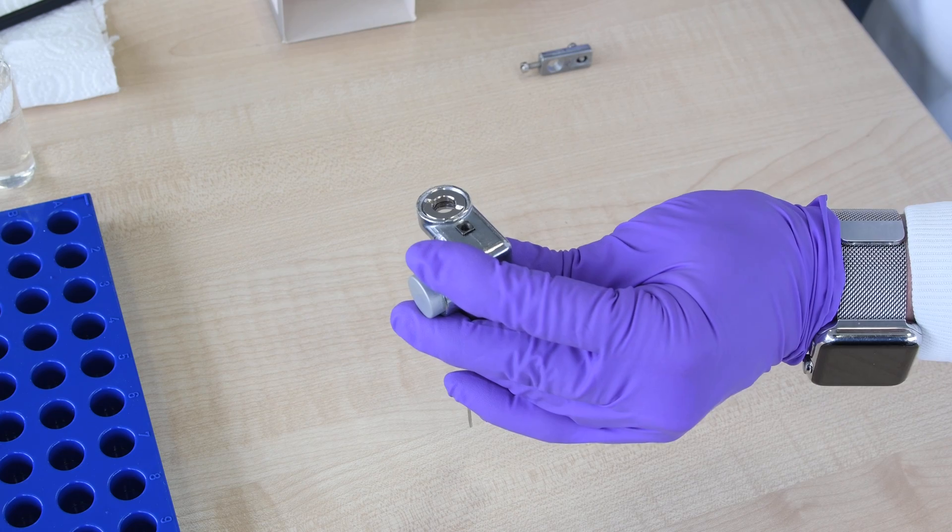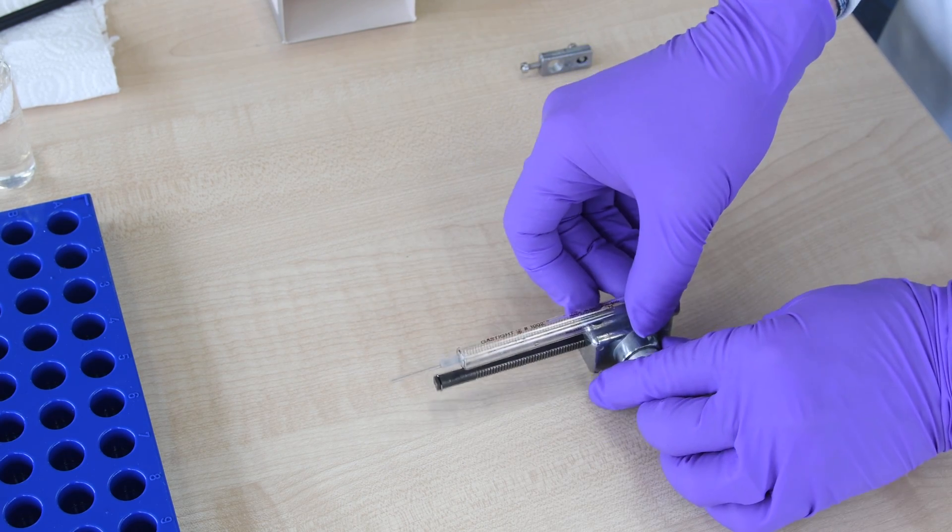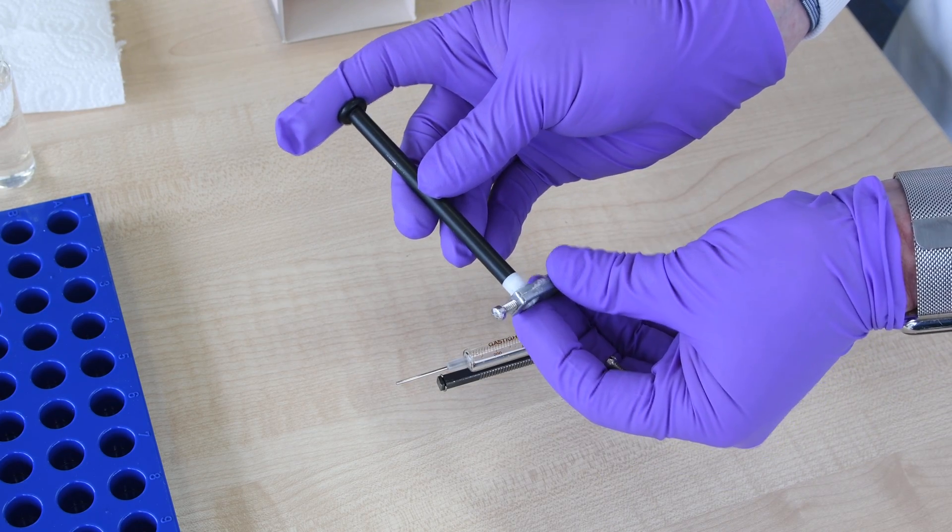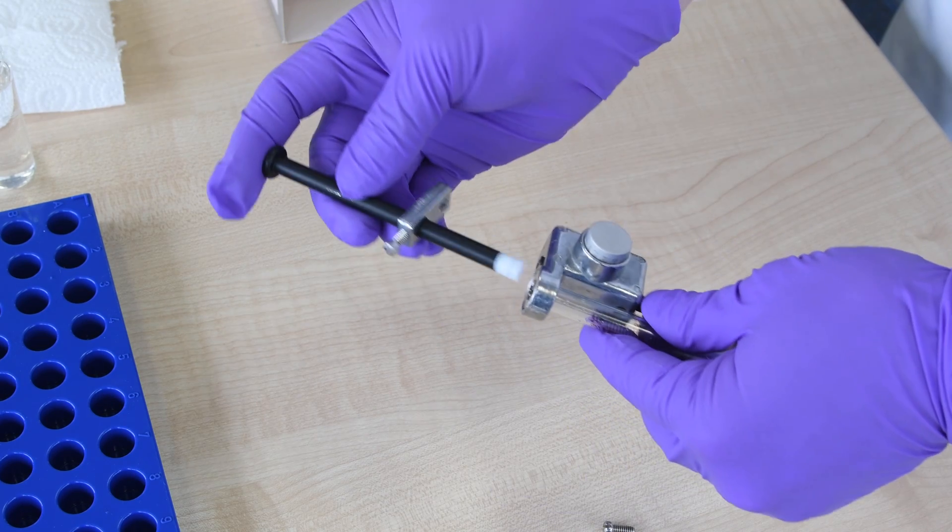Once the syringe is in place, we can now apply the plunger. The plunger goes through a retaining screw.